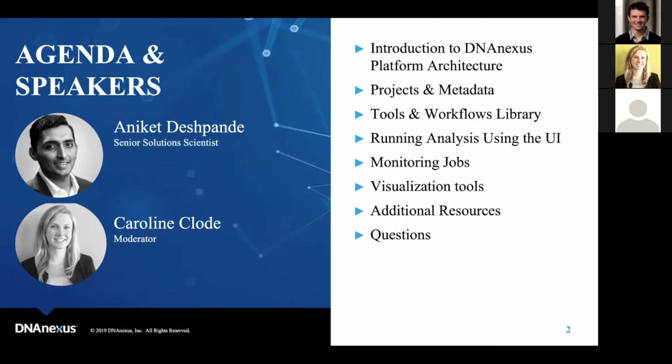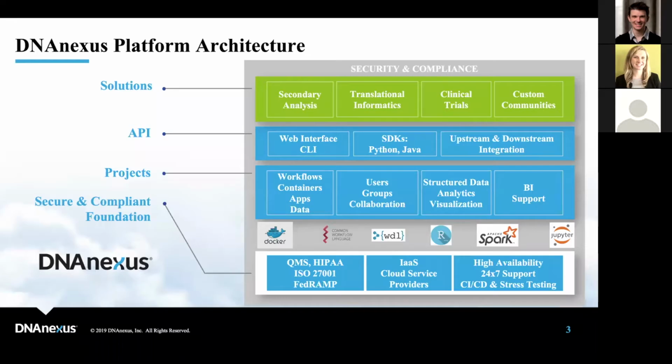Aniket will give you an introduction to the DNAnexus platform architecture and launch into a demo of how you can use the platform to share and collaborate around your data, track data provenance, use projects and metadata. He'll take you on a tour of the tools in the Workflows library, go into running analysis using the UI and visualization, and then talk about additional resources to launch you on your journey with DNAnexus, and then we'll cover some questions. So with that, Aniket, I will hand it over to you.